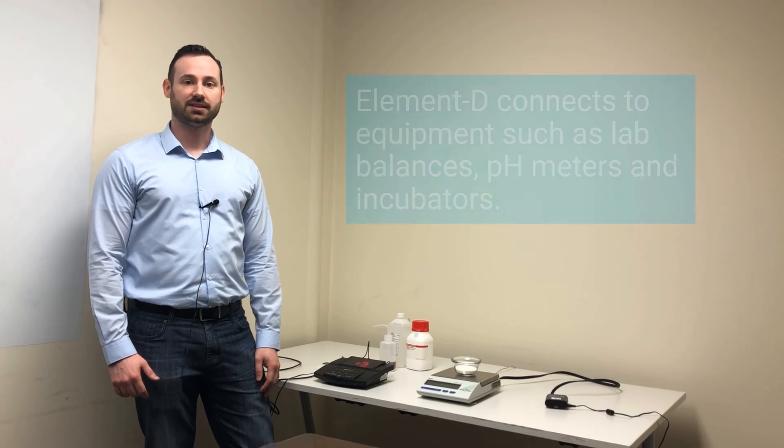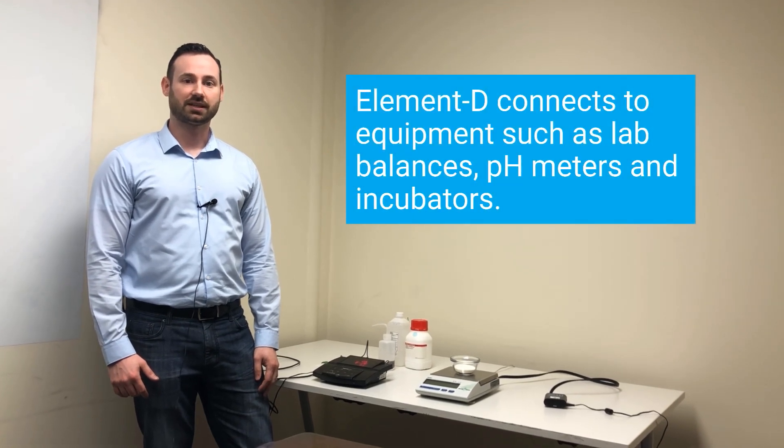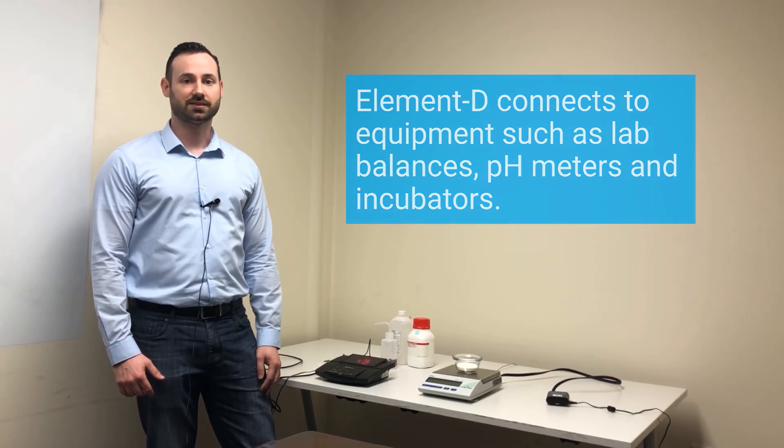Hey guys, Gil here from Elemental Machines. Today I'll be installing an ElementD on a balance. The ElementD records all data from typical lab equipment like balances, pH meters, and incubators.